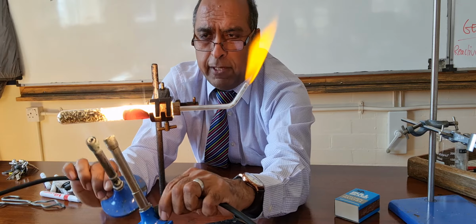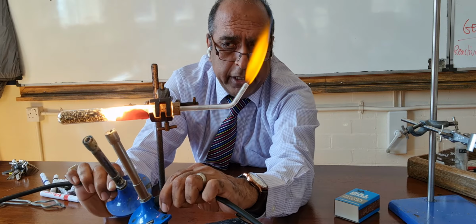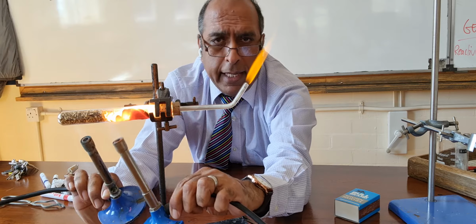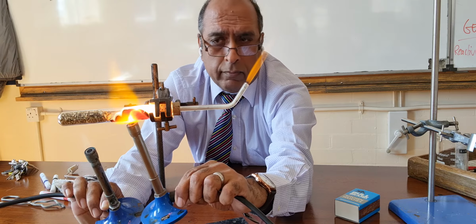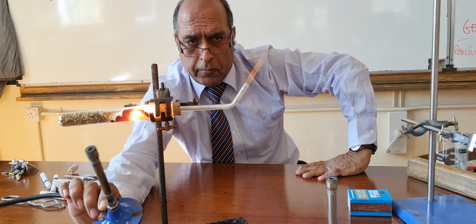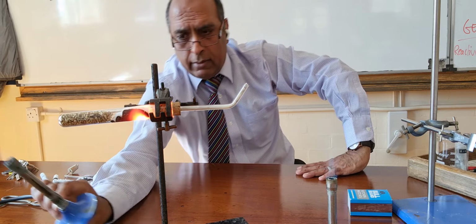Now I'm going to generate the steam. The steam will react with the magnesium. Rapid reaction, that is hydrogen burning at the end in a jet. And now there's no more steam coming out the end.